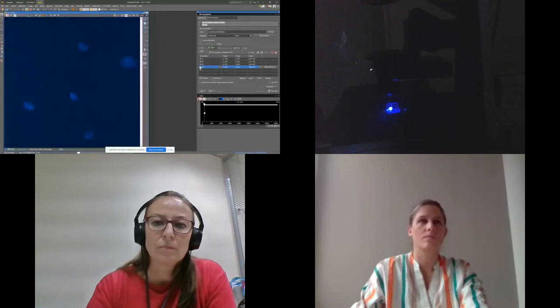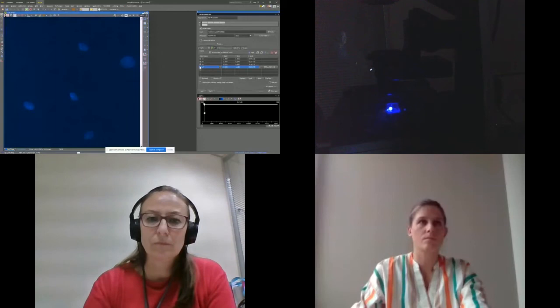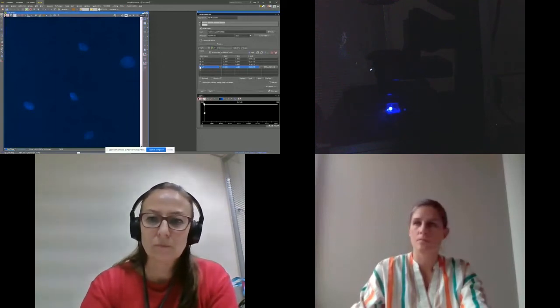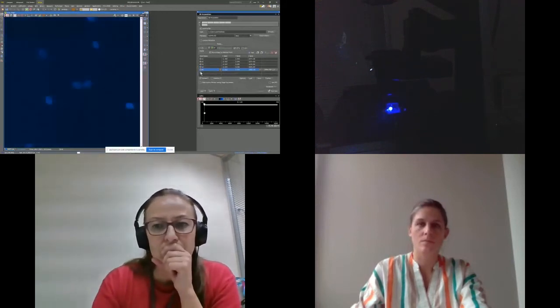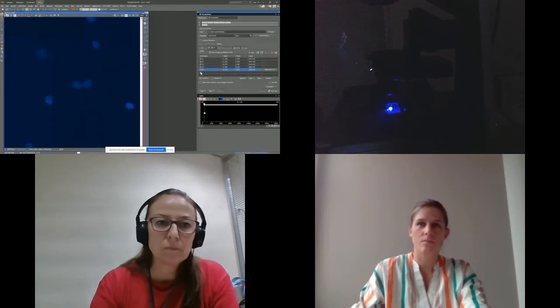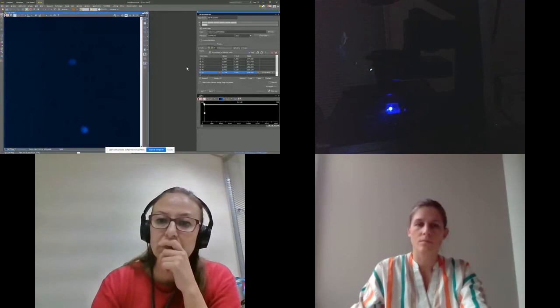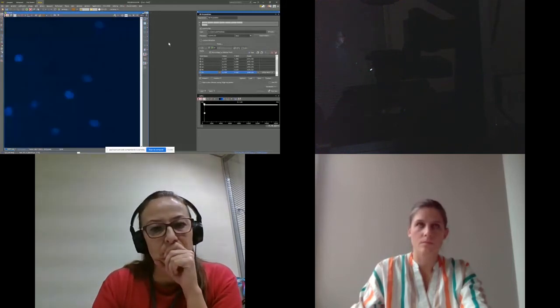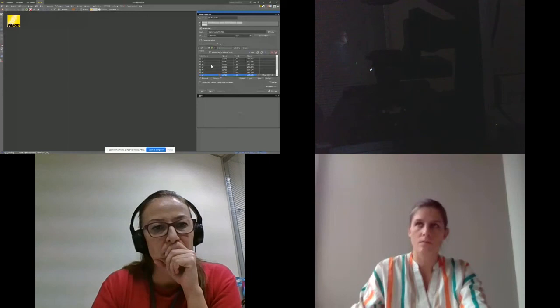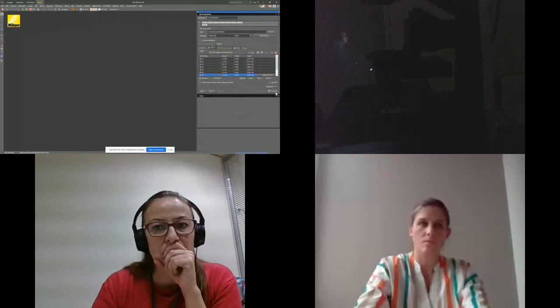Let's do it. This could be my fifth point, for example. And my sixth, I'm going to do it with 7 points. Just a number, can be any point. So this way I have now 7 points, and I'm going to reconstruct my, let's say, ground truth image by using artificial intelligence. I'm going to run it now.